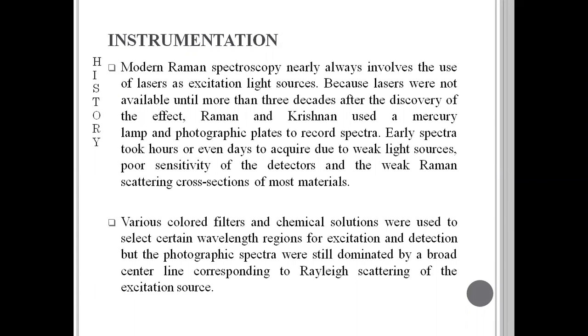Various color filters and chemical solutions were used to select certain wavelength regions for excitation and detection, but the photographic spectra were still dominated by a broad center line corresponding to the Rayleigh scattering of the excitation source.